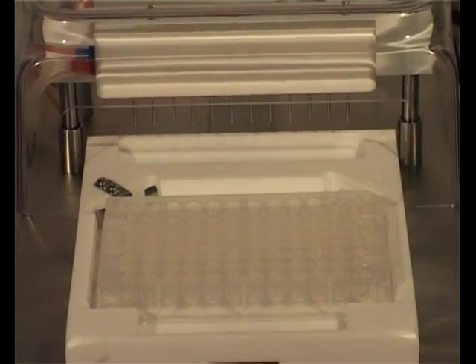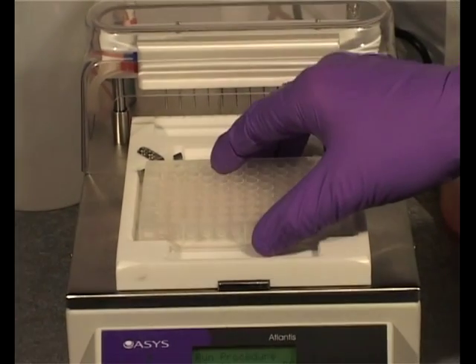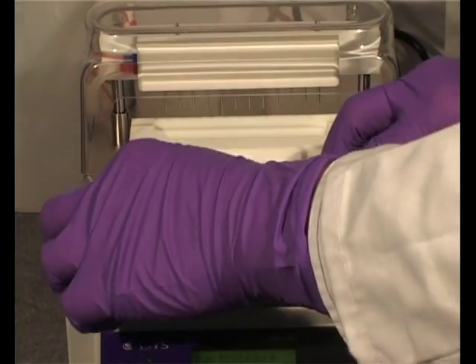The plate carrier is made of inert plastic and can be easily removed for cleaning or decontamination.